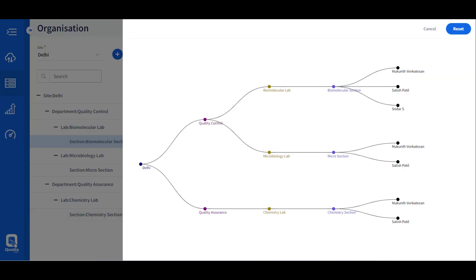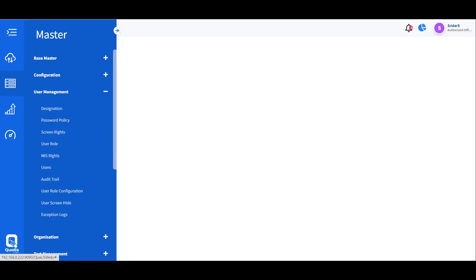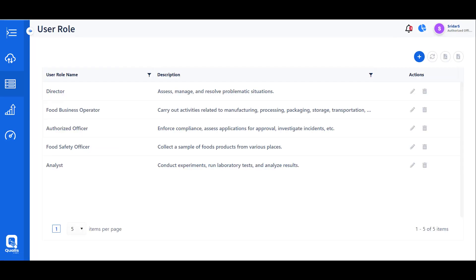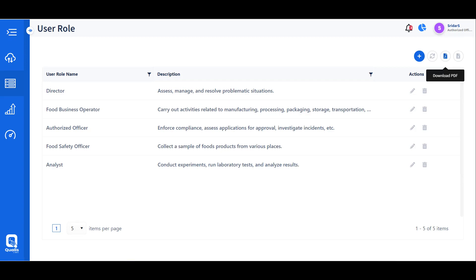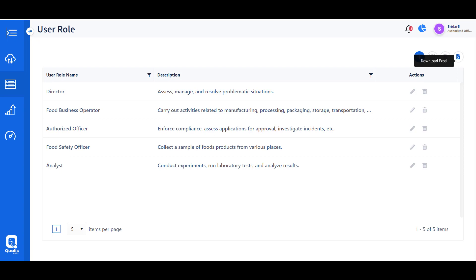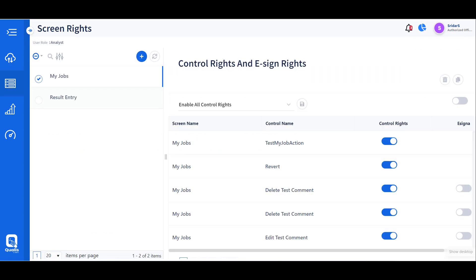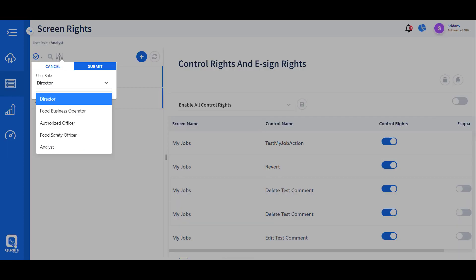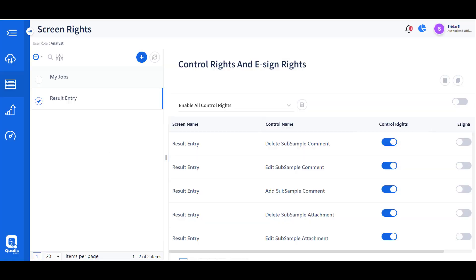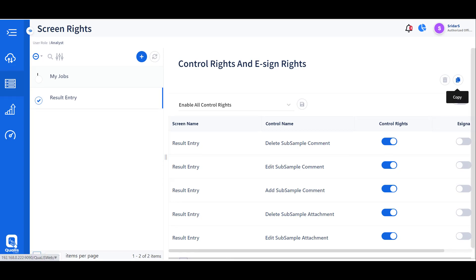User management allows defining various roles available in the organization, such as lab analyst, lab reviewer, supervisors, and lab managers. Each role can then be associated with specific screens where the work has to be conducted. Screen controls can also be enabled or disabled for each role.